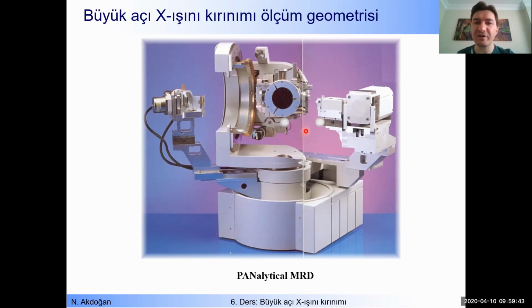So X-ray diffraction experiments are carried out by using such instruments in the laboratory, okay? At the university, in a research center, you can use them. But if you would like to use very high intensity and monochromators, you have to go to synchrotron radiation sources. We have given you much detail on synchrotron radiation sources. I will not repeat them here again. So let me continue if you don't have any question here.